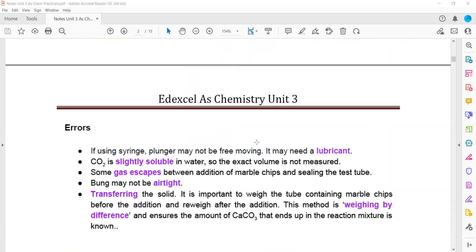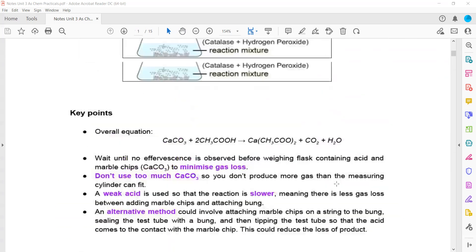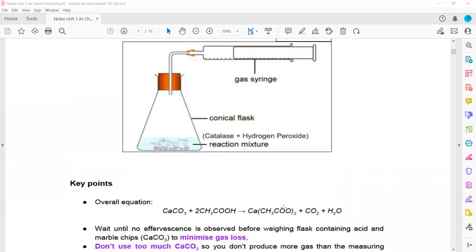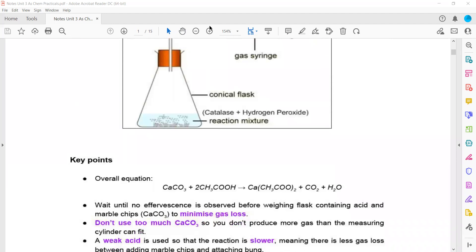When transferring the solid, it's important to weigh the tube containing marble chips before addition and reweigh after. This method of weighing by difference ensures the amount of CaCO₃ in the reaction mixture is known. We need to know the mass before and after—taking the difference gives how much reacted. From that mass, we calculate moles of CaCO₃ and then moles of CO₂.